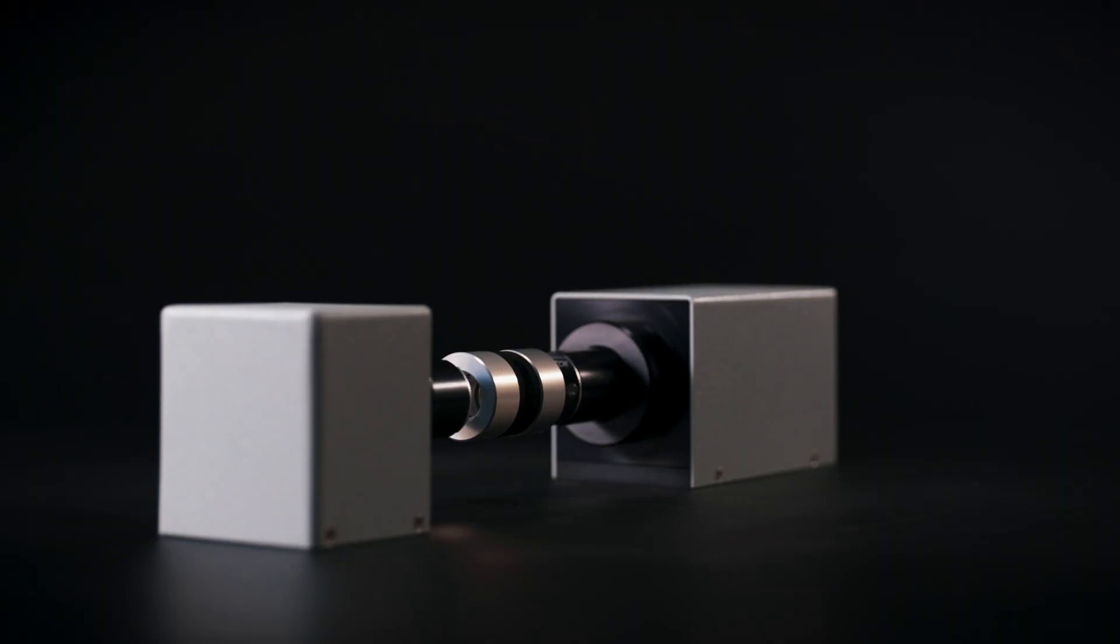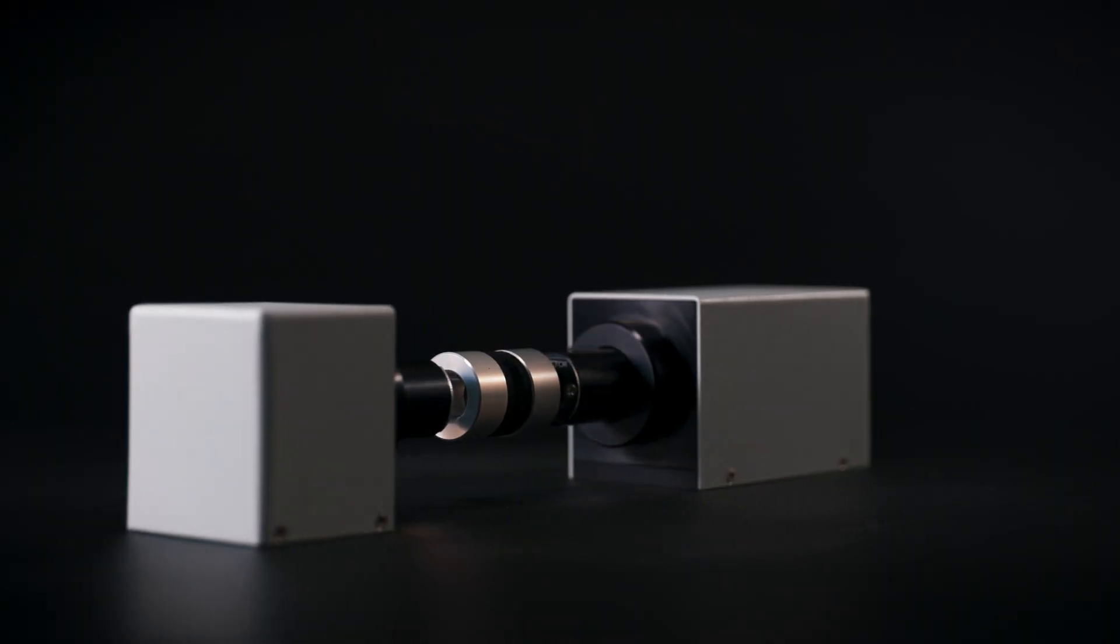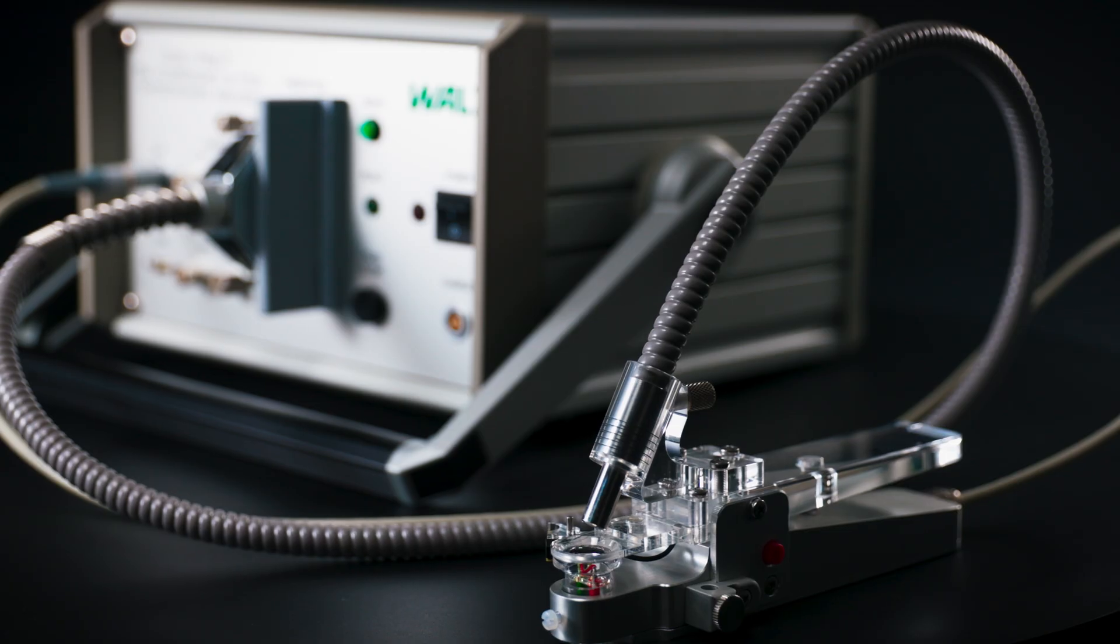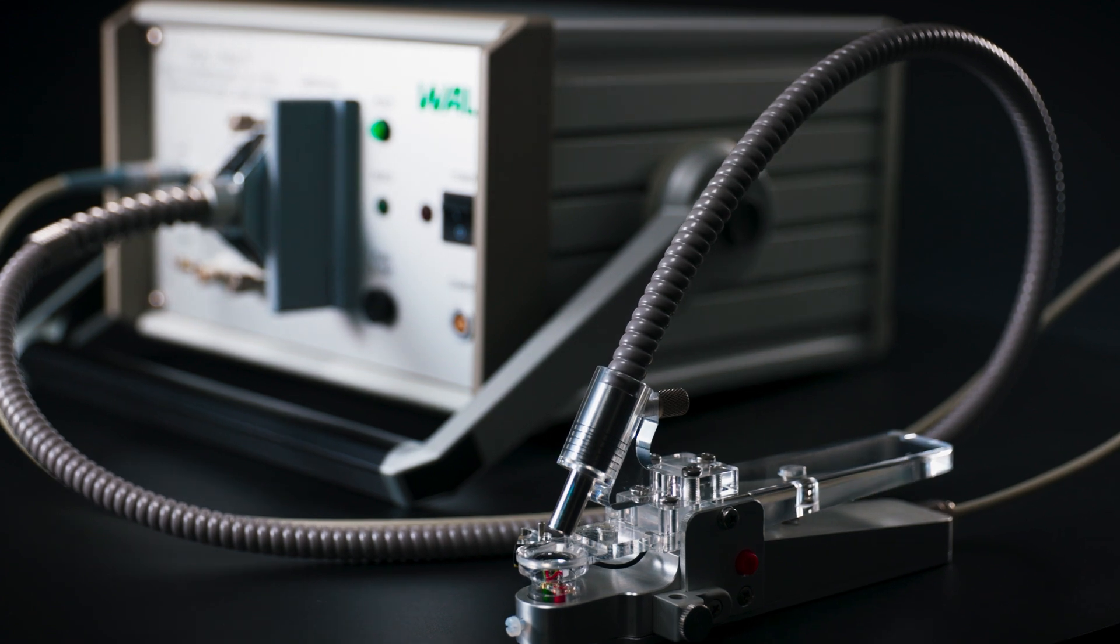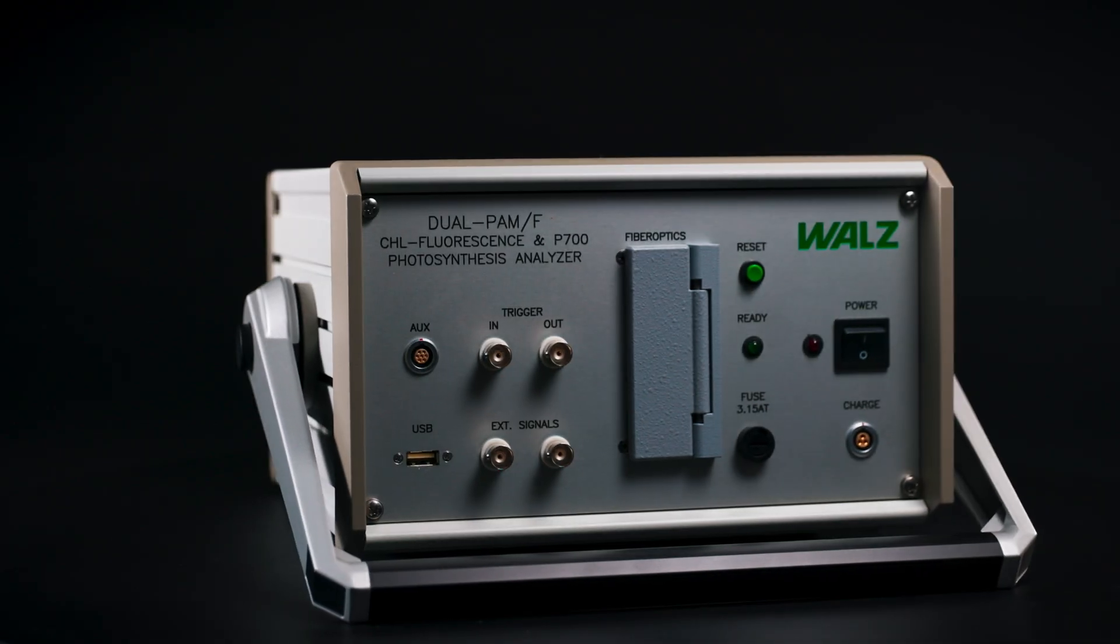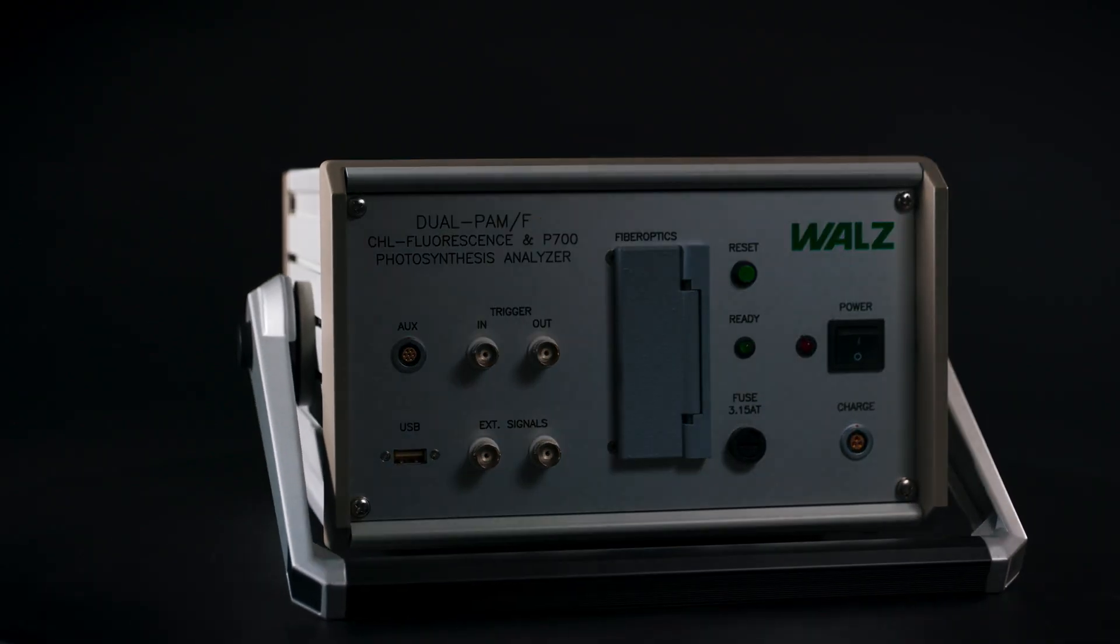The modular version allows for a variety of measurement setups. The fiber version is designed for high sample throughput, or when aquatic organisms are to be studied.